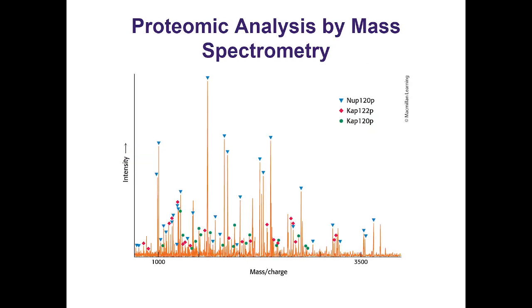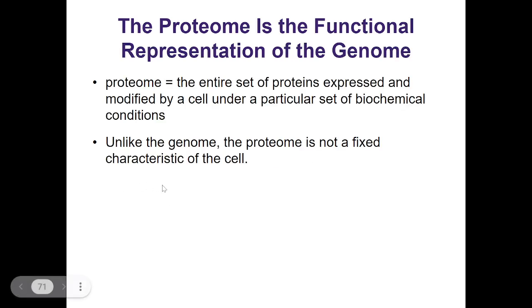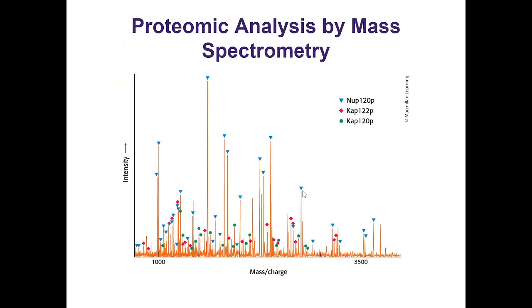This right here is going to be proteomic analysis by mass spectroscopy. And as you can see, here we have different spectra. And you can see how complicated those look, right? Okay. But you can see that you get different peaks for different variants, okay?